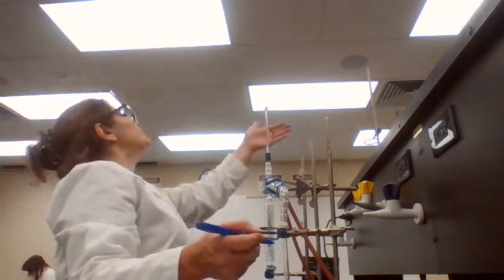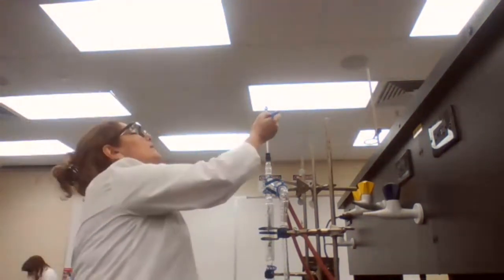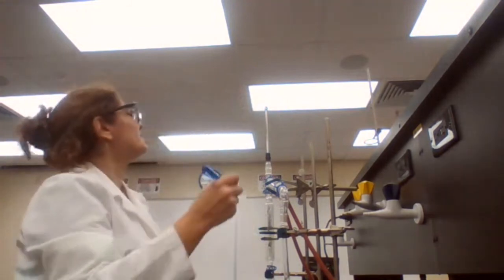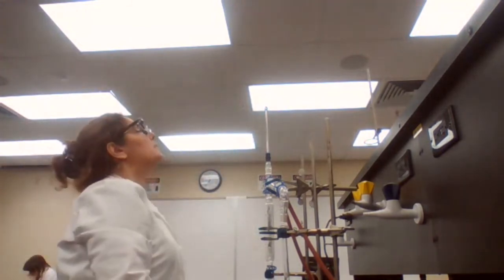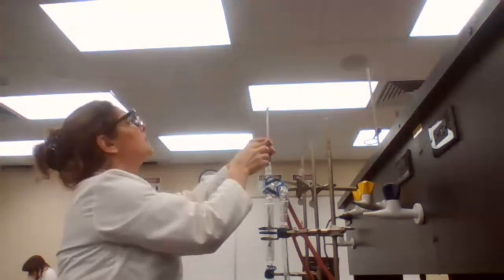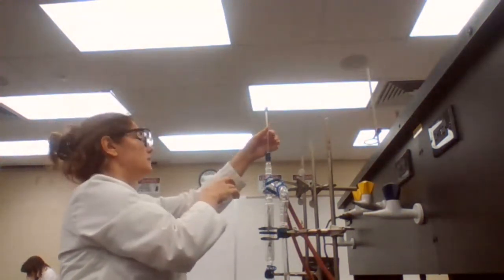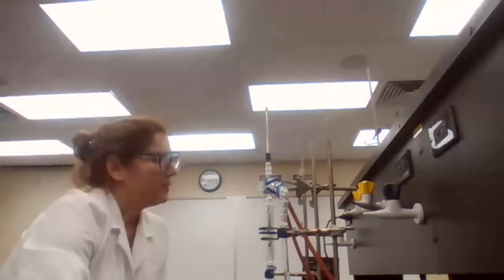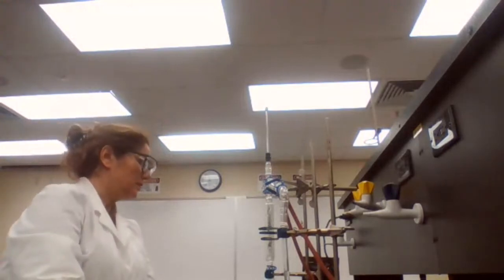Leave it blank. 2 milliliters is 77. 3 milliliters also 77. 4 milliliters 77. 5 is 77.